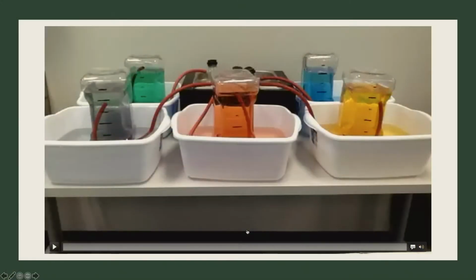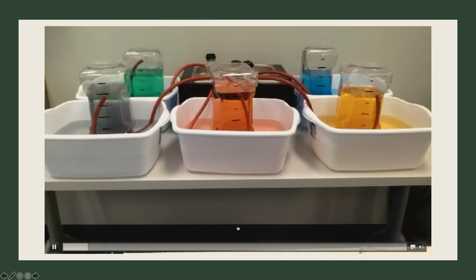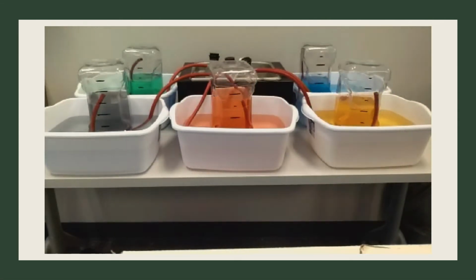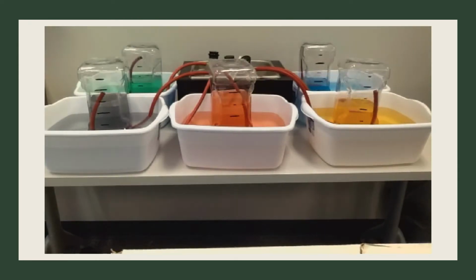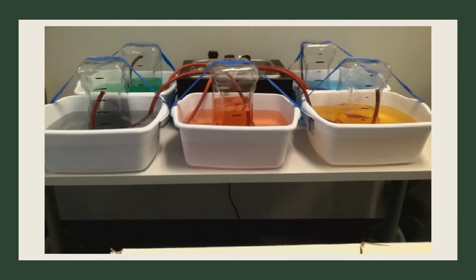We're wanting to record the most carbon dioxide that's collected. This is a video that we did in a time lapse with an iPad at one of the workshops. These are 5 different groups' samples, and you can watch them run throughout the day. If they're most of the way full with carbon dioxide by the time you leave at the end of the day, you can just reset them and record overnight and add the 2 volumes together.